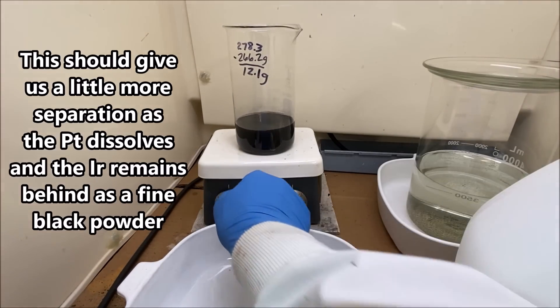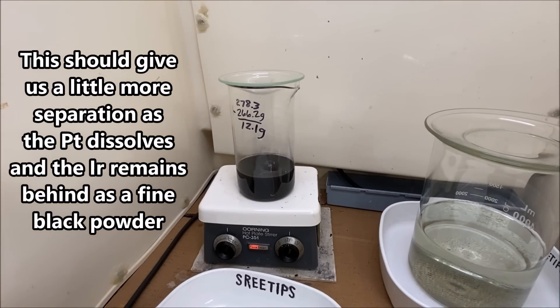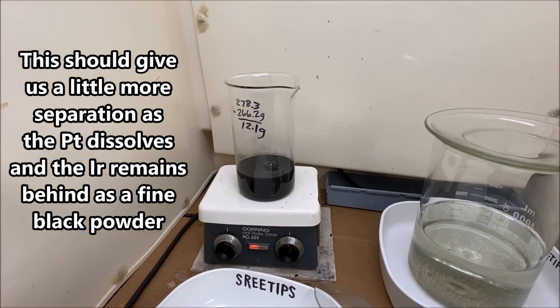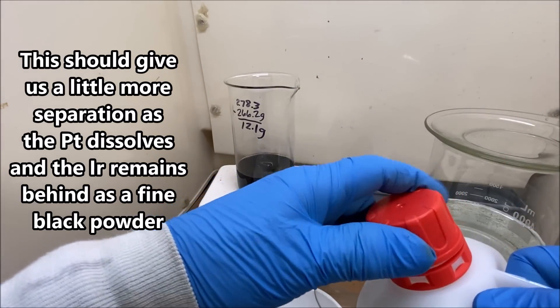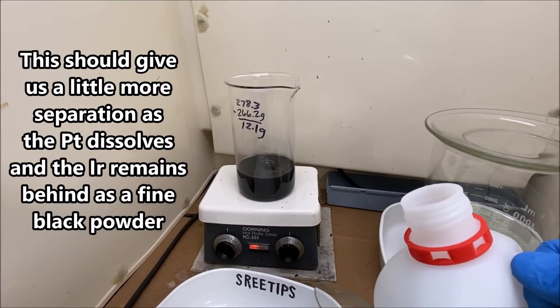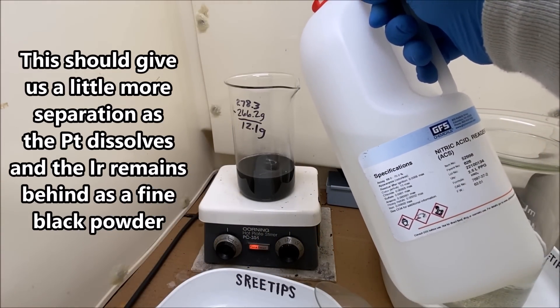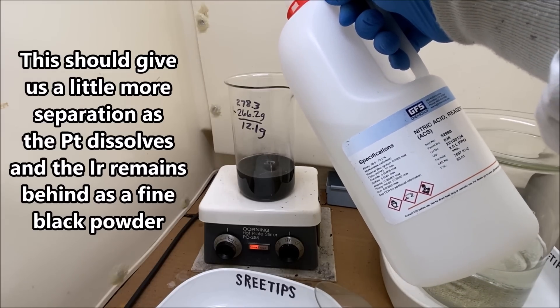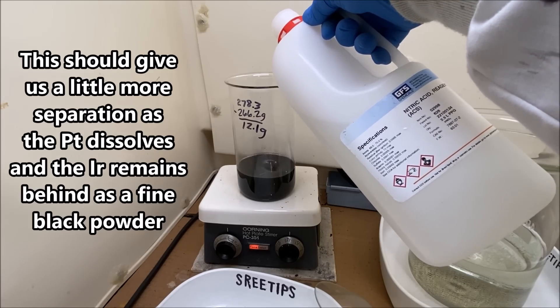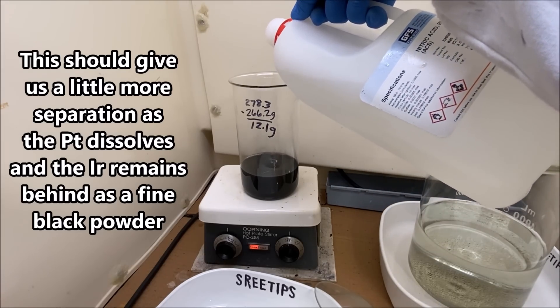When I say we had some success the last time we dissolved this stuff — we had it in metallic form like we have it here right now and we dissolved it with aqua regia — iridium, I believe, is the black residue that got left behind. So that gave us some separation. The platinum went into solution with the aqua regia; the iridium stayed behind. So that's why we're going to try to dissolve this again with aqua regia.